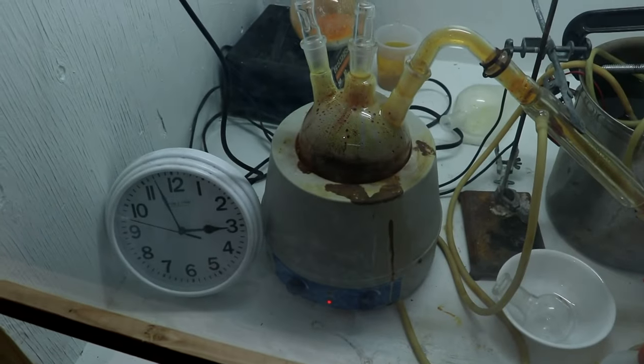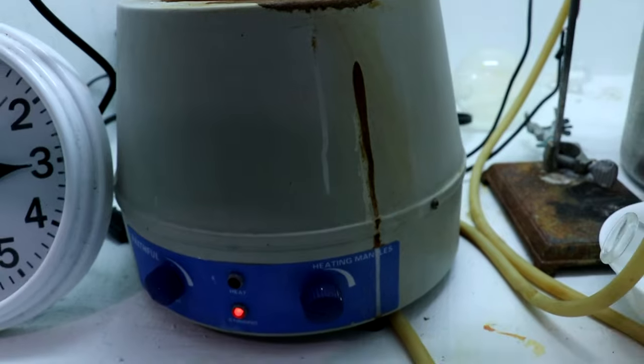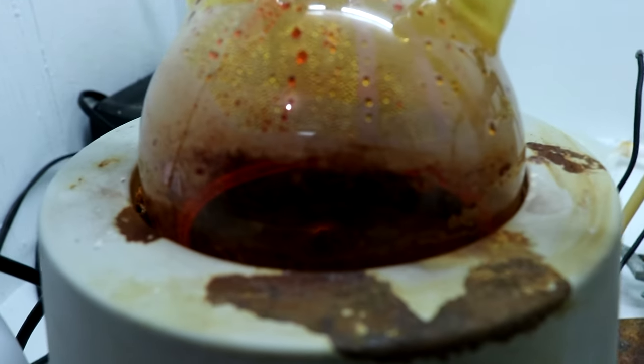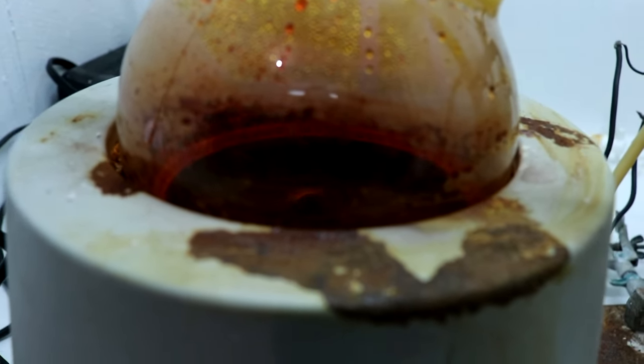So I was still up and I decided to come check on this before I actually went to bed. So it's been just over an hour. And I noticed something. Look at that. It's actually stirring. See a little vortex in there? You know what that means? It means this gold has been dissolved to the point that the stir bar works.